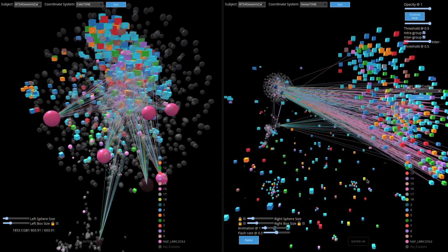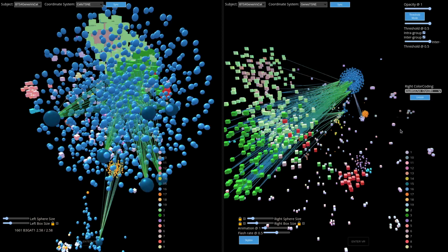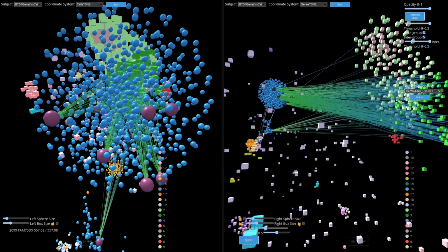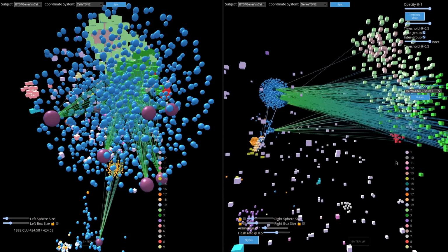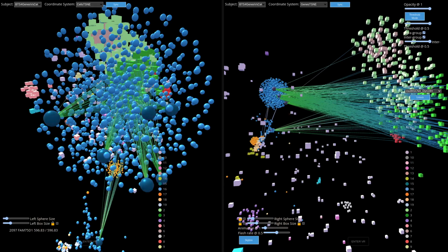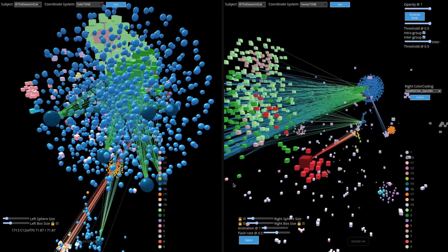So now that we have a bit of a graph edge connectivity web enabled, we can maybe change from fusion coloring to a WGCNA module coloring and see what sorts of modules are expressed by the fusion harboring cells.